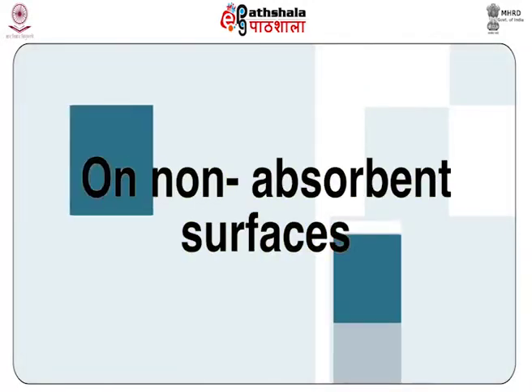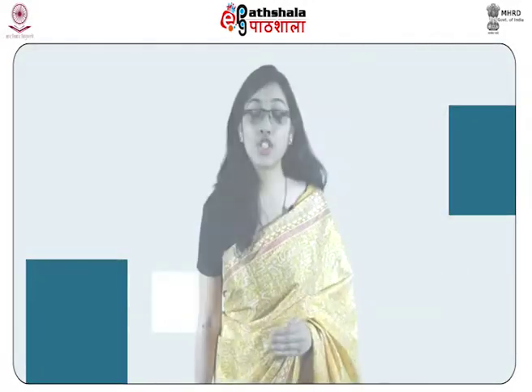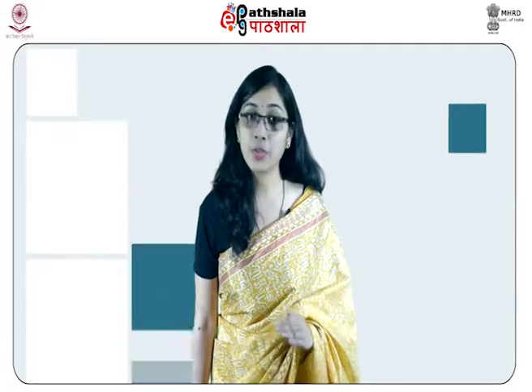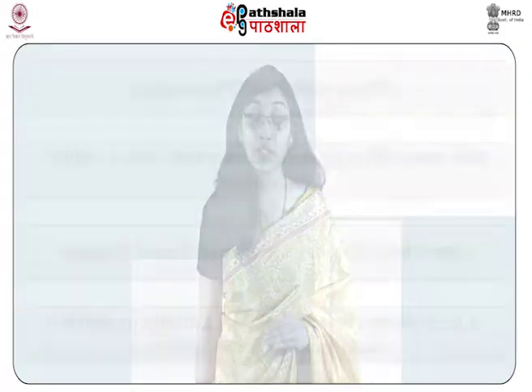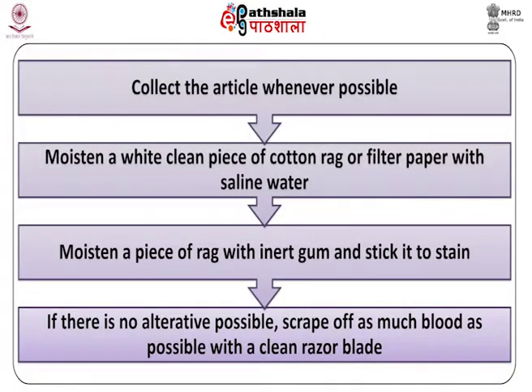On the non-absorbent surfaces. To collect blood from the non-absorbent surfaces, one should collect the article wherever possible. Moisten a white clean piece of cotton rag or filter paper with saline water and press it against the stain. The stain is transferred to the piece.